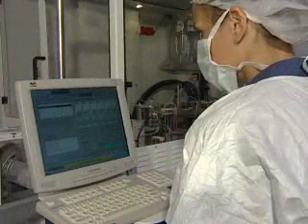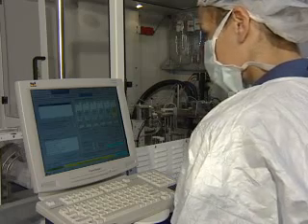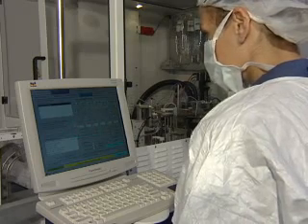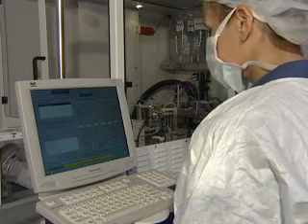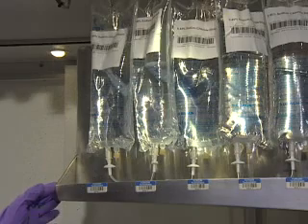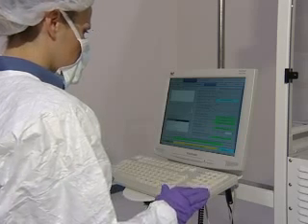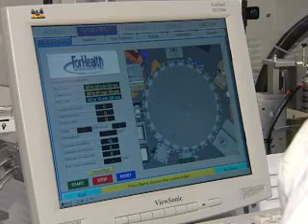The technician enters the reservoir order into the console of the device and processes supply actions. When prompted to check the drug supply, the technician clears any existing drug bags and then scans the reservoirs into the system. The process involves scanning the bag location, the reservoir label, then the bag location once again for safety confirmation. If the reservoir is incorrect, the software will not allow the user to proceed. The technician then completes the remaining supply action, clicks on the Continue button, and then clicks the Start button.